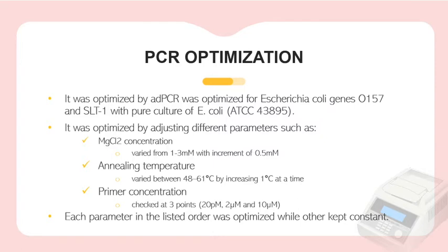In this process, lowering the temperature enabled the primers to attach to their target sequences on the single-stranded DNA. And lastly, primer concentration.